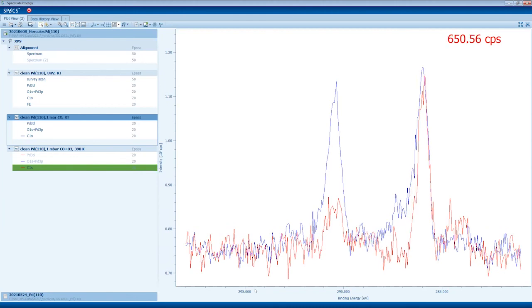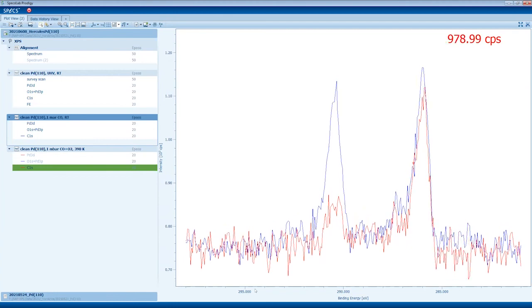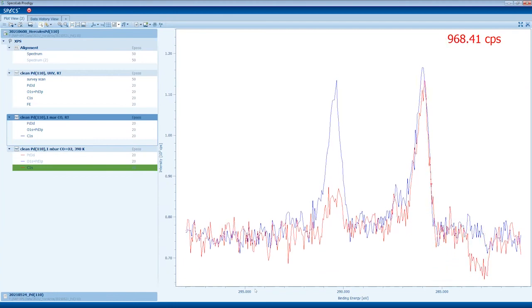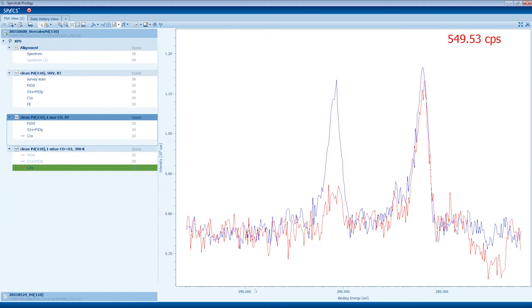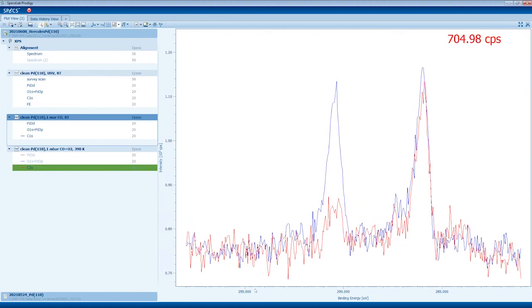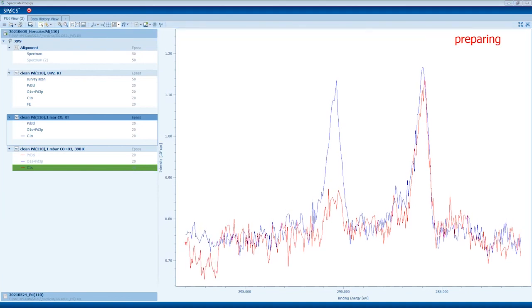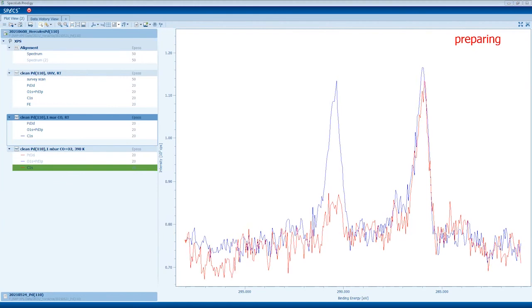You put the sample, you do such measurements, you fill the cell with some gases, and you see the kind of results shown here. When you have some gas phase, you have some adsorbate there. You see that changes are sometimes not really big, especially concerning the adsorbate. However, you can also apply for measurements at synchrotrons.